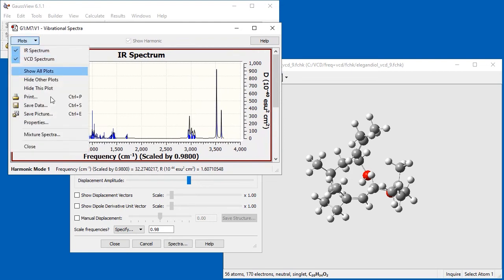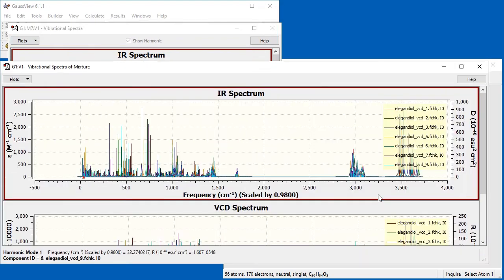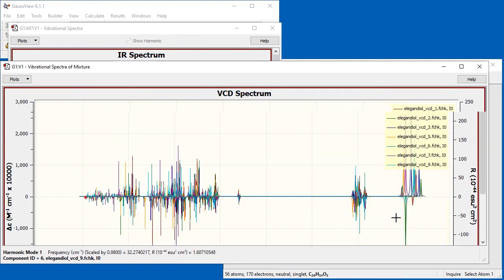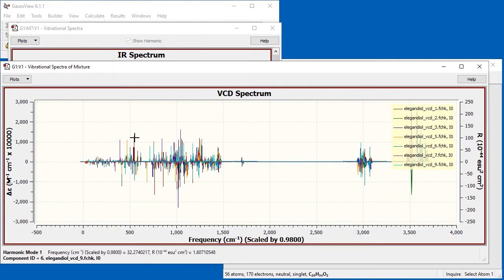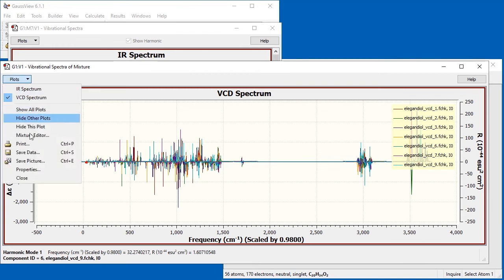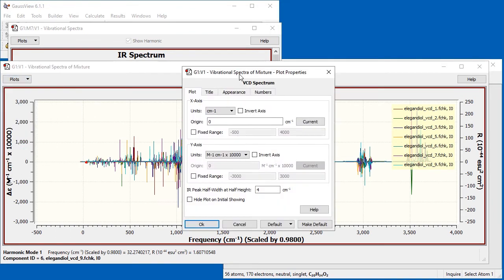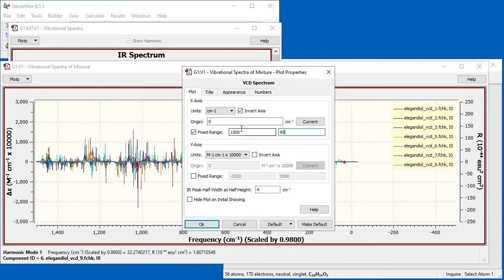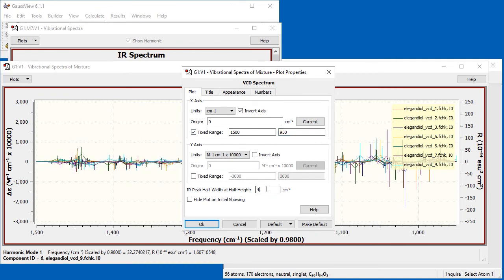We then select Mixture Spectra from the menu. Once it opens, we focus on the VCD spectrum, which contains all of the predicted spectra superimposed. We open the Plot Properties and modify the direction and range of the X-axis. We also change the IR Peak half-width at half-height value to 8 inverse centimeters for comparison with the original publication.